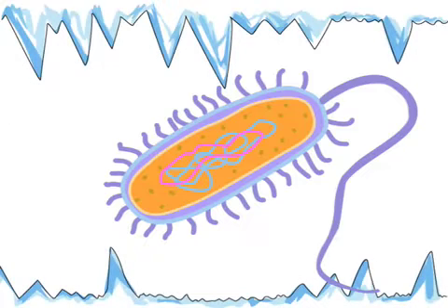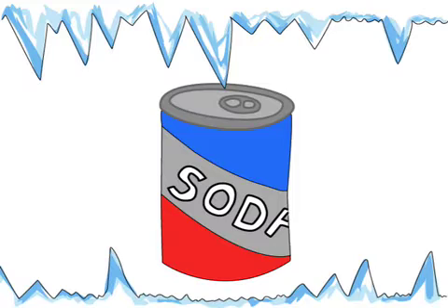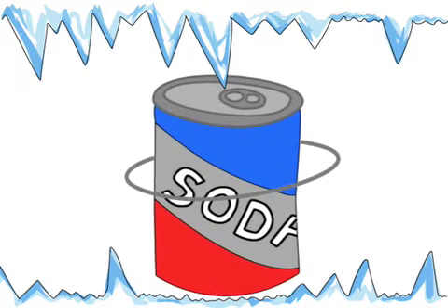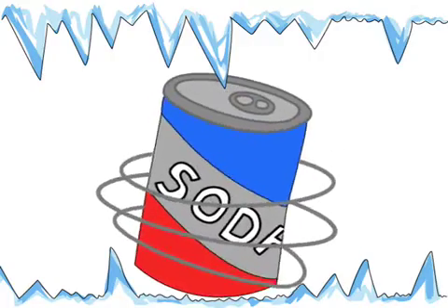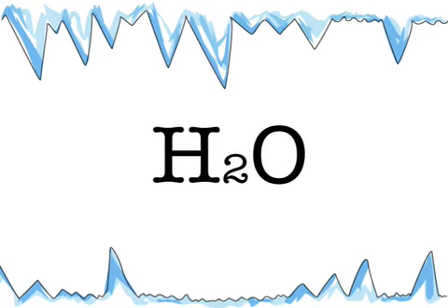With dry ice, we will snap freeze the cells, causing them to swell up and burst. This reaction is similar to when a soda can is put into a freezer. When a soda can is frozen, the contents inside the can expand and will eventually burst. Both the soda can and the cell contain water, and water expands when frozen.